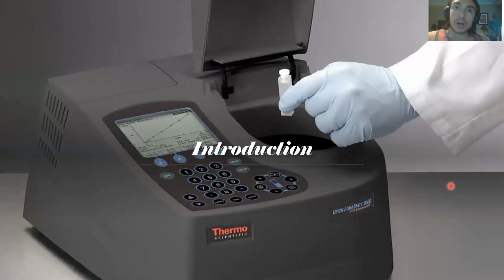So a spectrophotometer is an instrument that measures the amount of photons, the intensity of light, that gets absorbed after it passes through a sample solution. And with the spectrophotometer, the amount of a known chemical substance, its concentration, can also be determined by measuring the intensity of light detected.